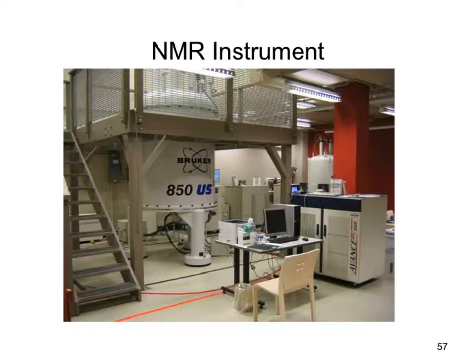Cylinders of gas are magnetic and will usually go flying through the room and come slamming into the instrument and usually destroy it. That usually results in the end of that person's job because an MRI is mildly expensive. Yeah, just mildly.